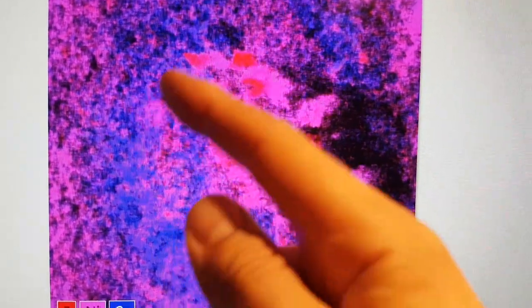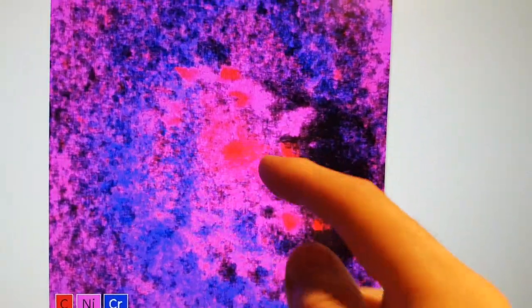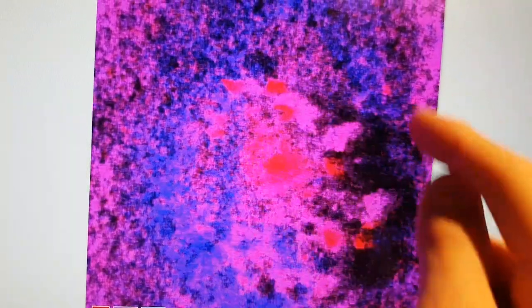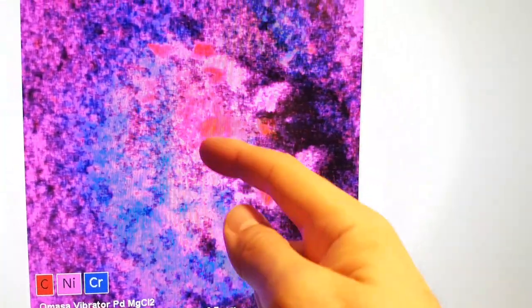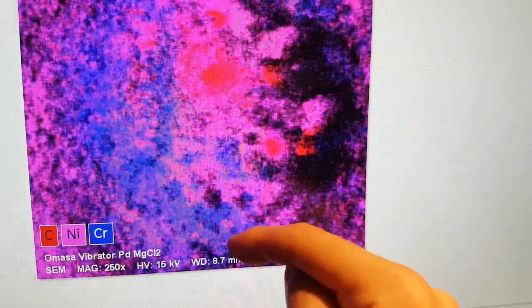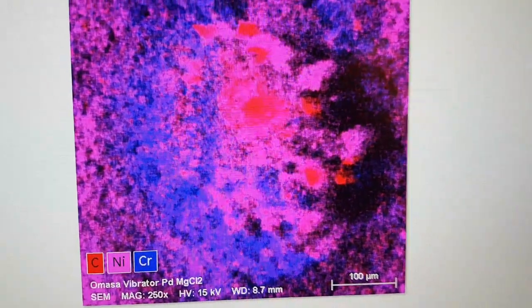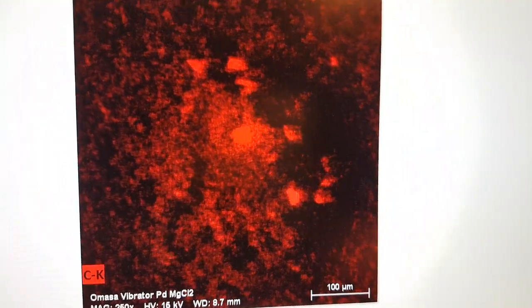It's shadowing because this is actually very raised. As you can see here, when it goes around the different lights, you can actually see shadows. So these structures are not cavities on the surface of the palladium-coated stainless steel plate. They are actually deposits on there. So really, what this made it look like as deposits and built up, that is exactly what it is.